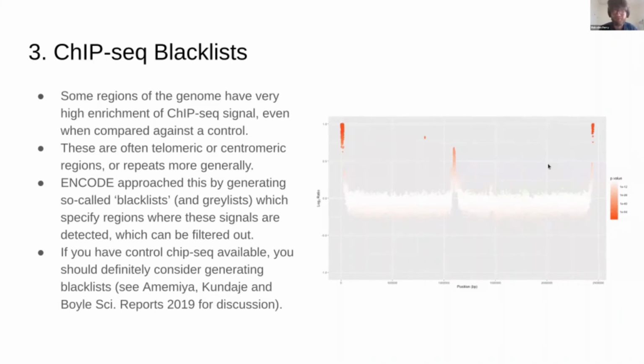But that's an important thing, because otherwise, I've seen this happen in lab meetings during my PhD. Someone would get a list of top enriched peaks, and they would all be right at the end of the chromosome and just obviously all wrong. They'd be 5 kilobases long and nowhere near any genes or anything.